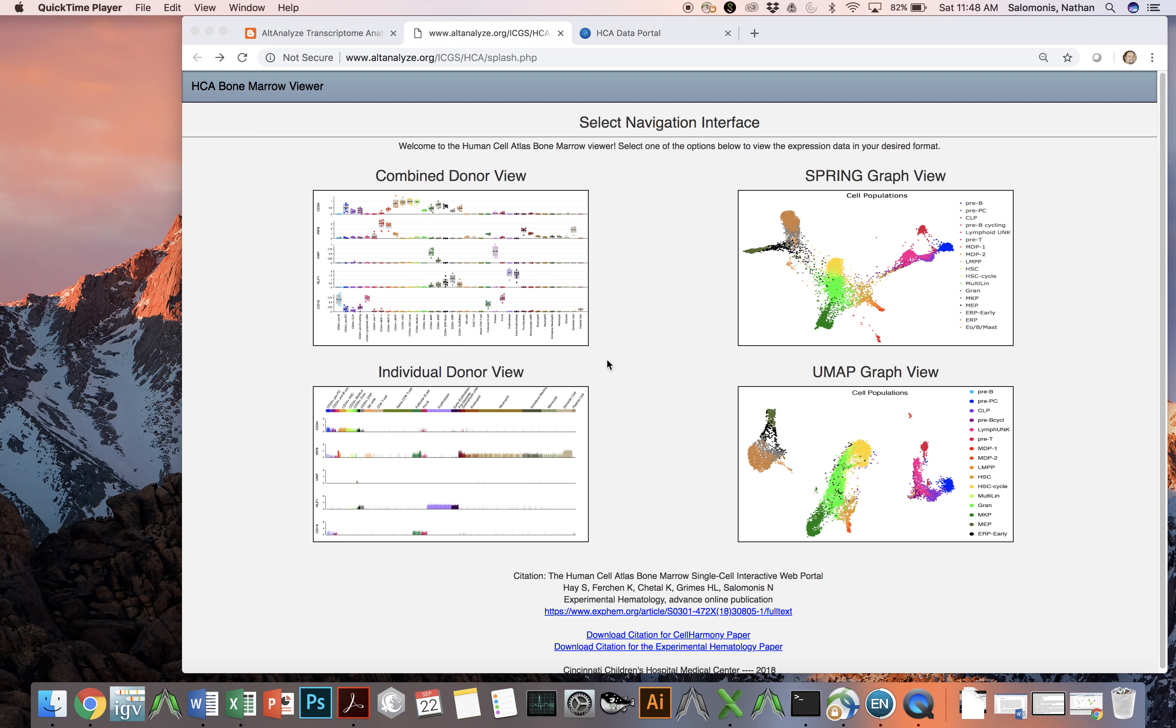In this video, we introduce a new interactive web portal for data from the Human Cell Atlas Project. Specifically, bone marrow RNA sequencing data for eight healthy individuals spanning over a hundred thousand cells.